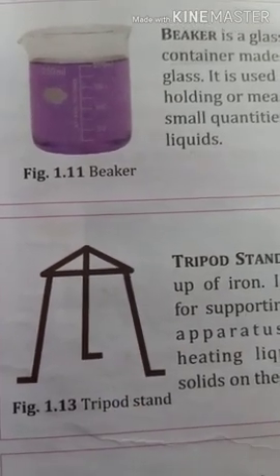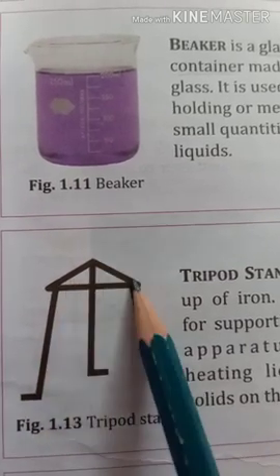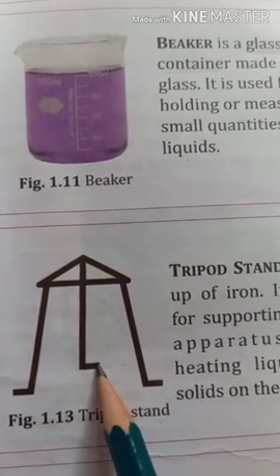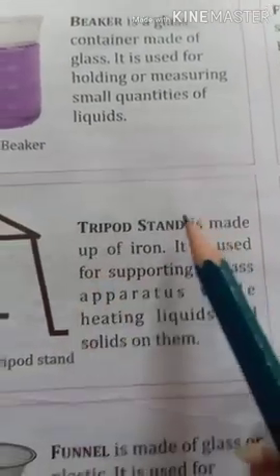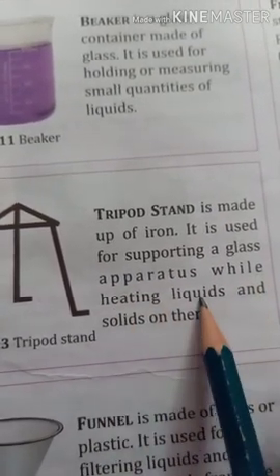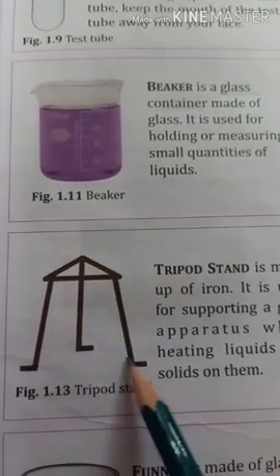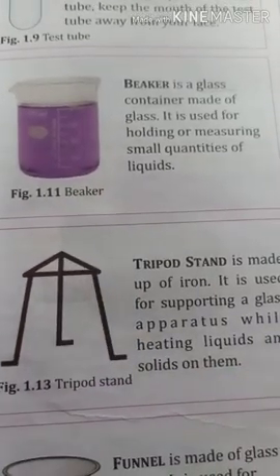Next is the tripod stand. Tripod stand is made up of iron. This is a tripod stand and it is made up of iron. This tripod stand is similar to the stand on a gas stove used in our kitchens. So this tripod stand is made up of iron and is used for supporting glass apparatus while heating liquids and solids on them. So while heating liquid on gas, this tripod stand is used just as a support for another apparatus.